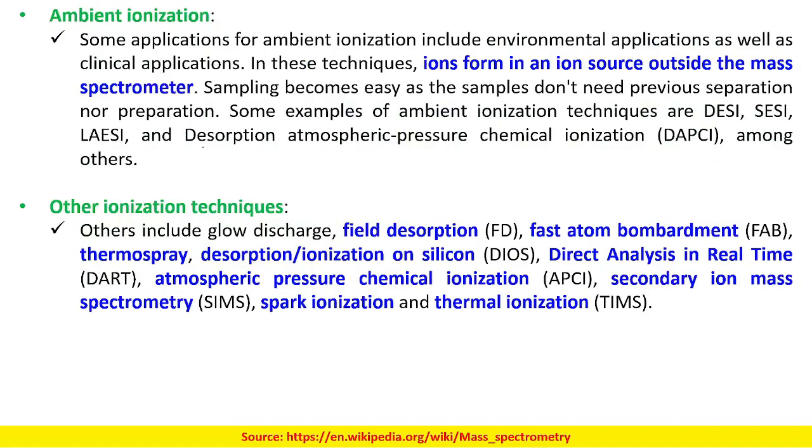Then ambient ionization. Over here ions are formed in an ion source outside the mass spectrometer. And among other ionization techniques, field desorption ionization is there, fast atom bombardment is there, where you use another atom to bombard the sample. Then we have thermal spray, and desorption ionization on silicon.